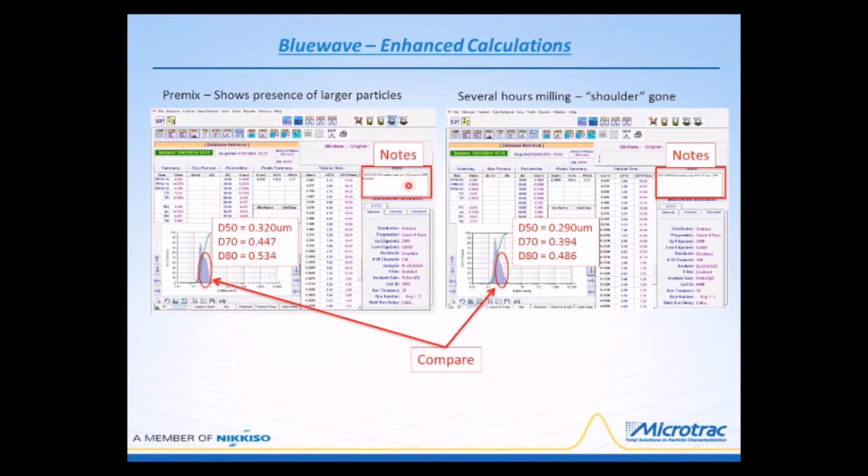if you have a Microtrac, these notes can be really valuable, and you'll notice that Tony put information in these notes. These notes are like a little word processor, and every record that's saved will have any information located in this note section saved as well.